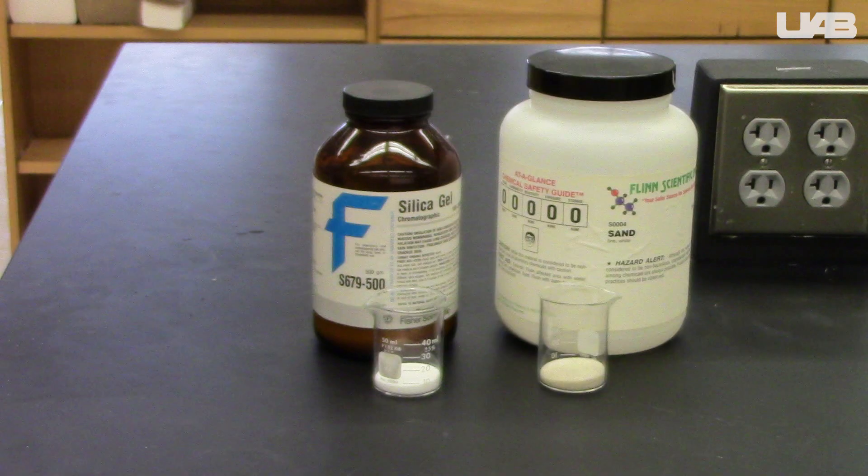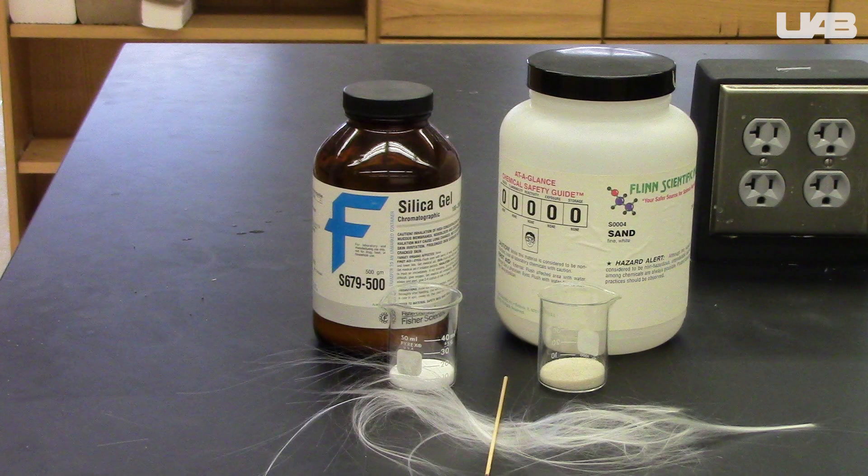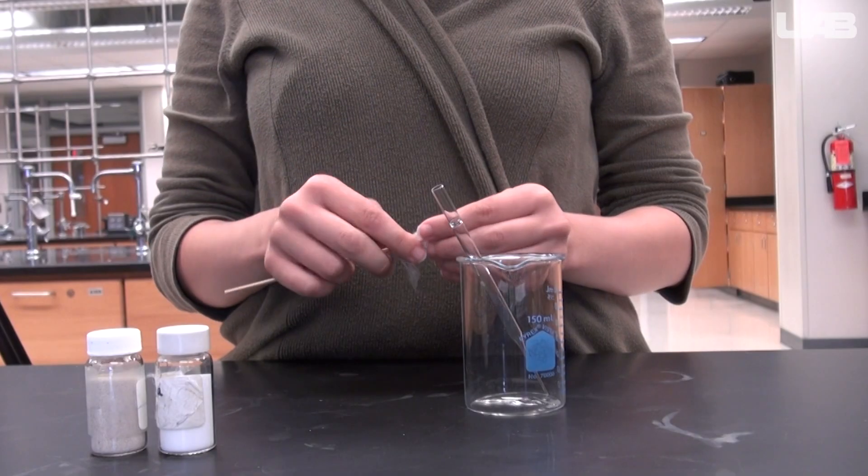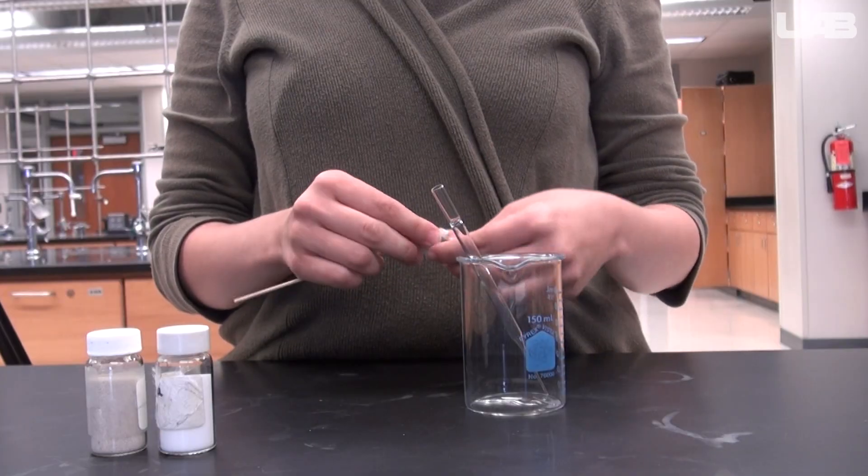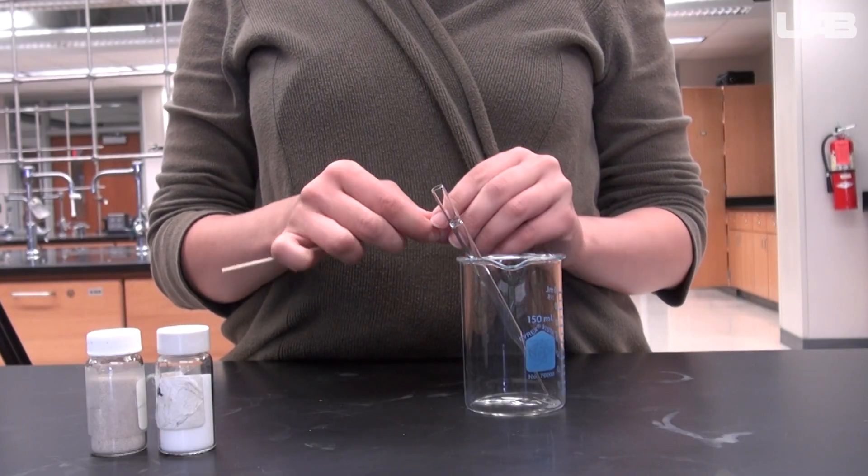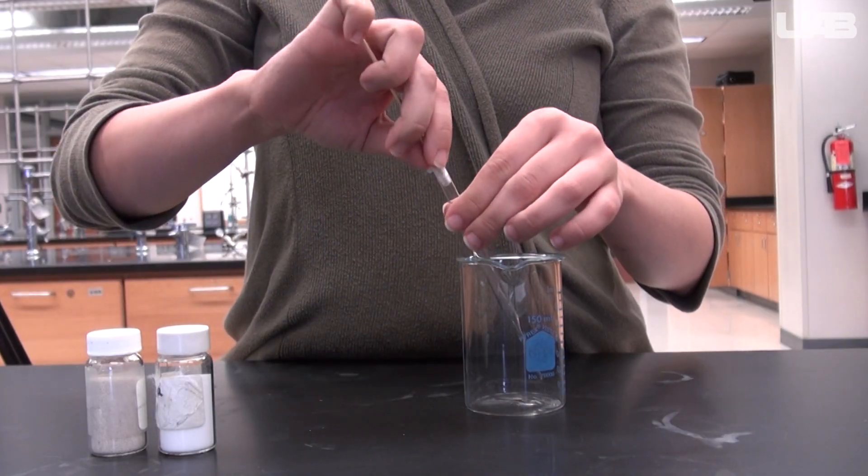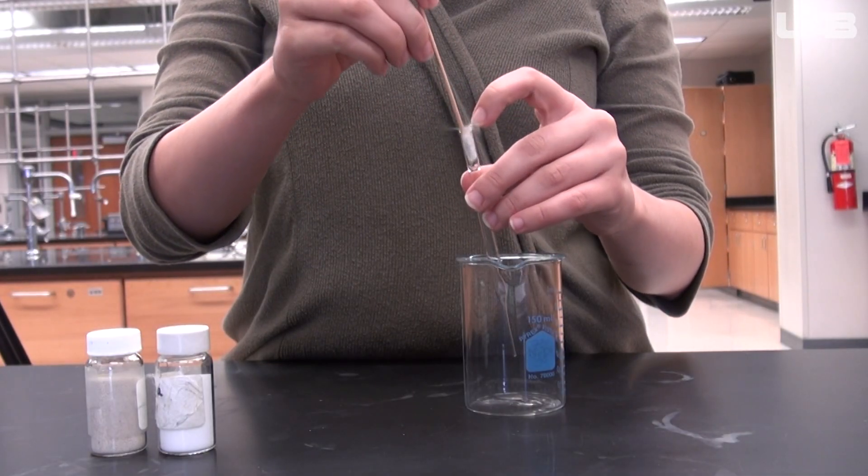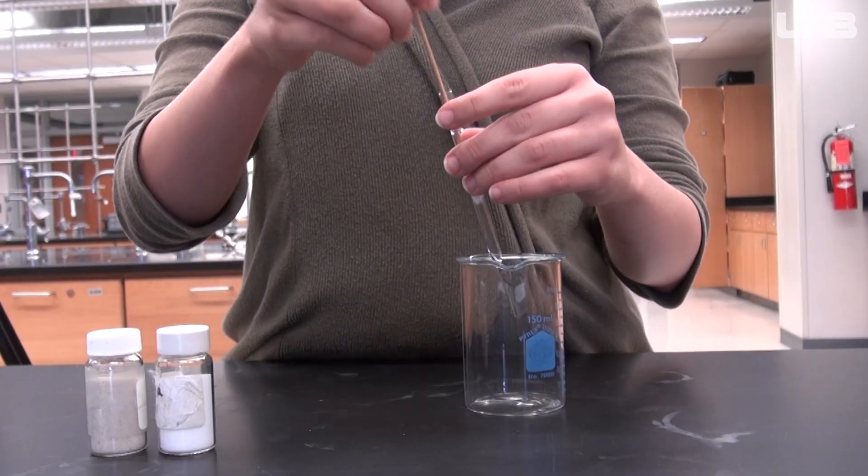You will need silica gel, sand, glass wool, a small wooden rod, a Pasteur pipette, and two scoopulas. You will take the glass wool and bunch it up to form a plug. Then use the wooden rod to press it down to the bottom of the Pasteur pipette. It should be tight enough that the stationary phase does not go through, but loose enough so that it allows the mobile phase to flow through.